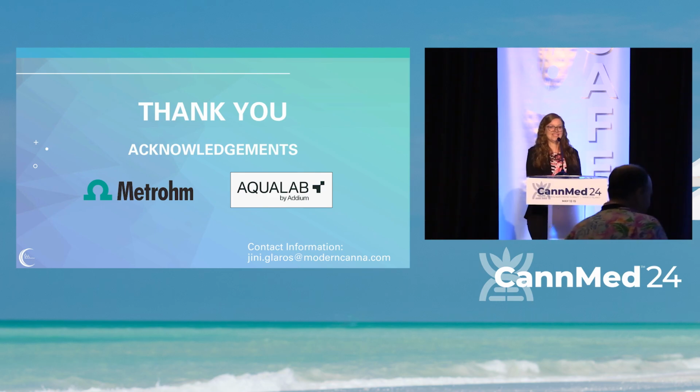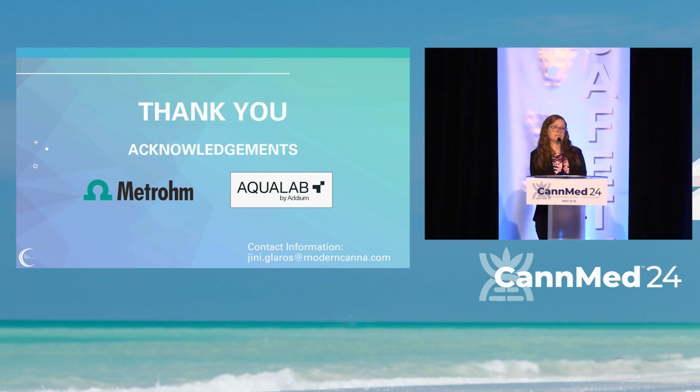Thanks, Jini. So it appears the drying technique here can alter the cannabinoid profile and not necessarily reflect what the patient's going to be consuming. Is there any motion toward moving to aerosolizing smoke and measuring the actual inhalation products? Because all of this stuff's going to get decarboxylated anyway when someone decides to light up a flower. So it seems like we've got a bit of a struggle here: we have raw cannabinoid content, then you get rid of the water content, and if you over dry it, some of the cannabinoids change. But at the end of the day, the patient's never going to see any of that. They're going to see pyrolytic cannabinoids.